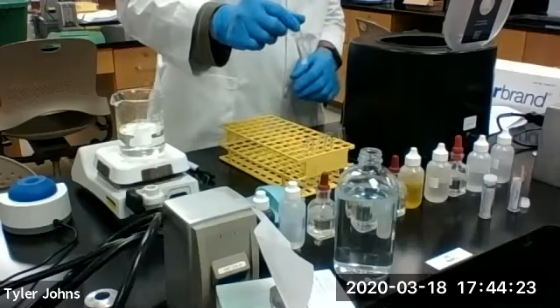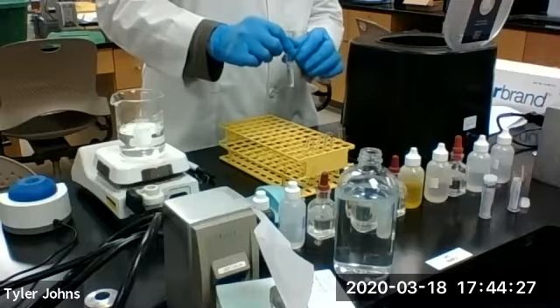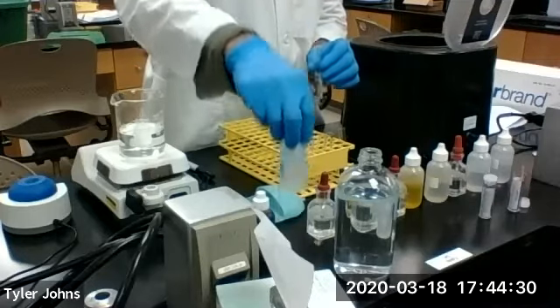And after we add the ammonia, we're going to be adding half of a milliliter of 1 molar sodium phosphate.